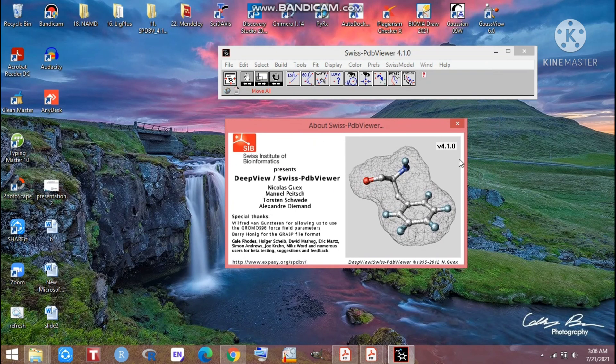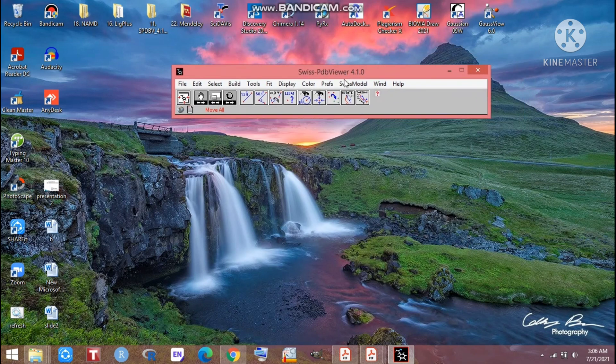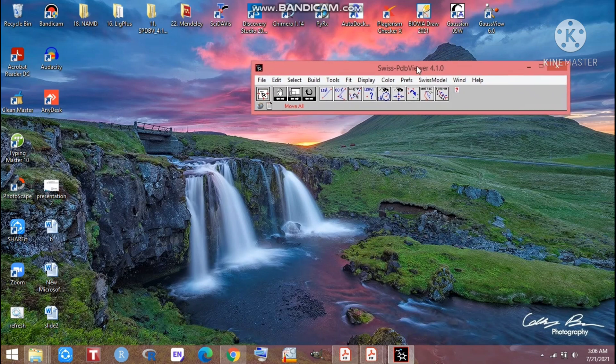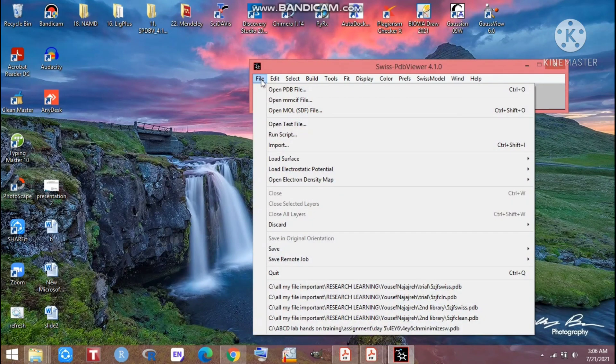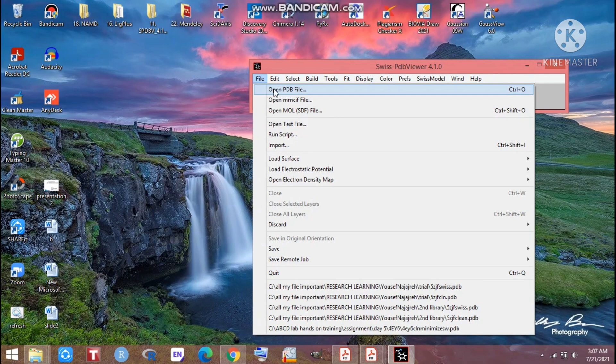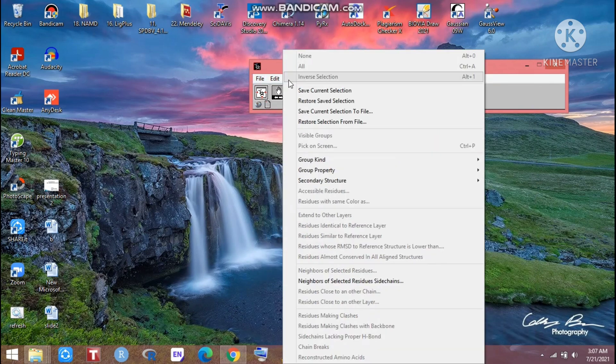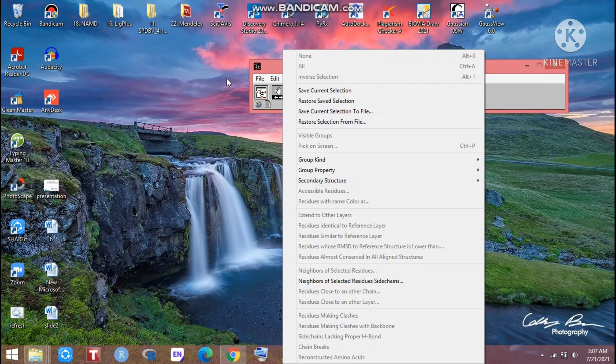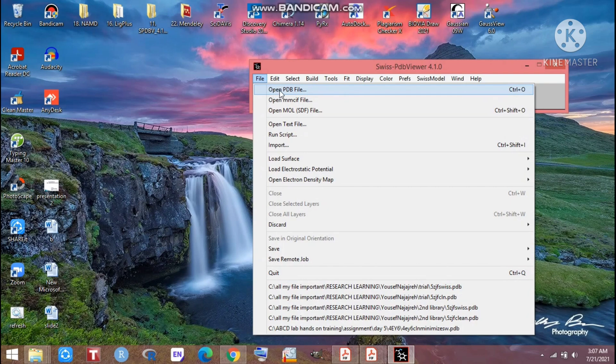Just click the cross here, no need to use it right now. Look at that, here is File, from here we can open. Here are some editing folders and select options. First of all, we have to go for File and open PDB.